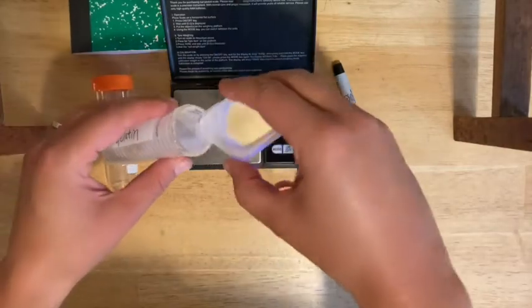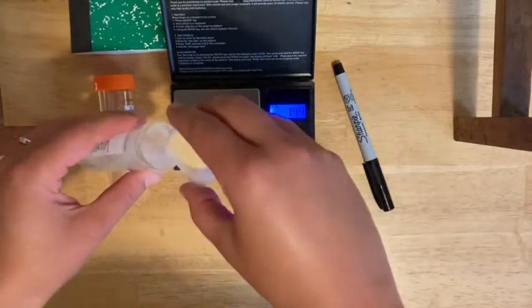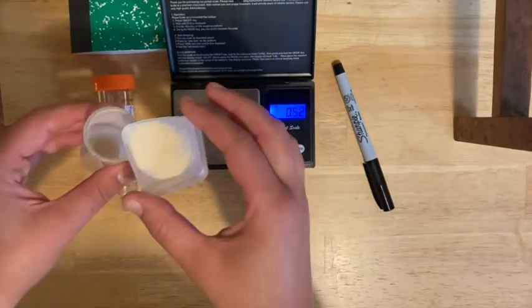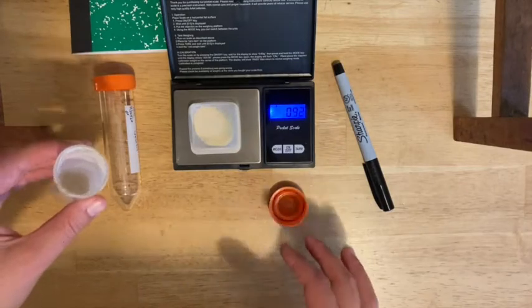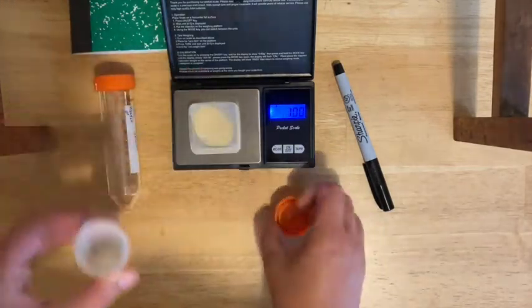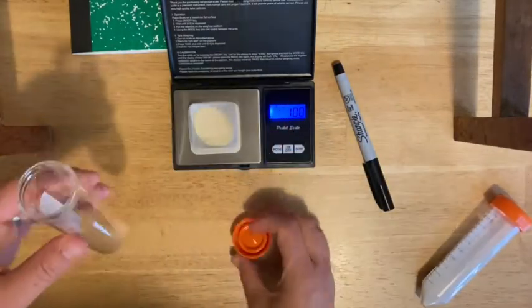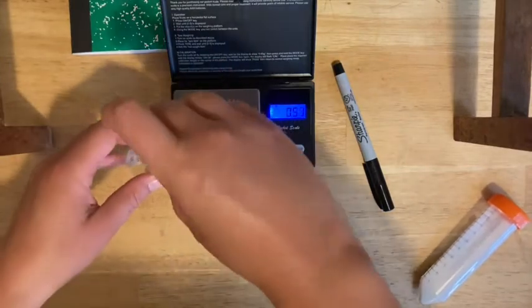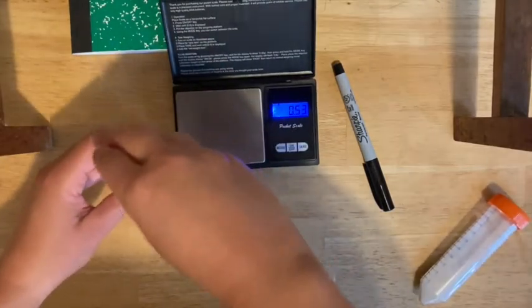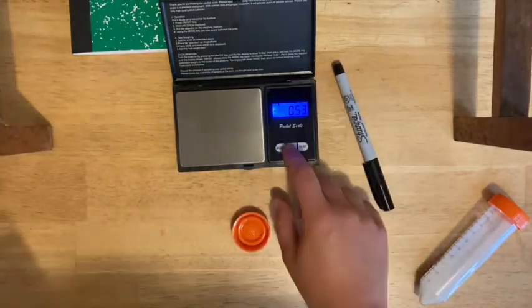If it goes way over, you can tap a little back in. When you get to the right amount, you're going to put it into your tube. That's it for the balance.